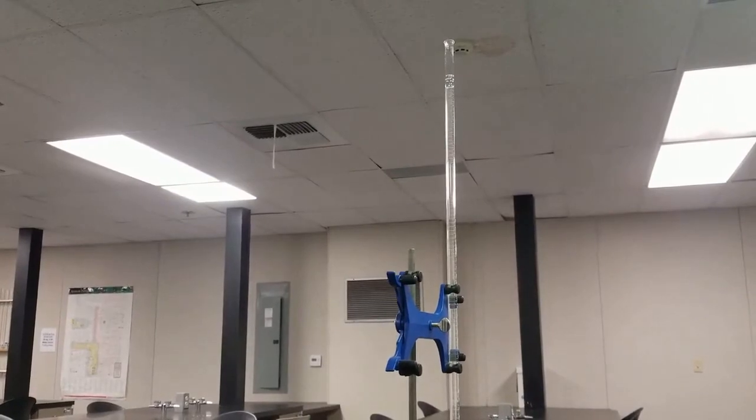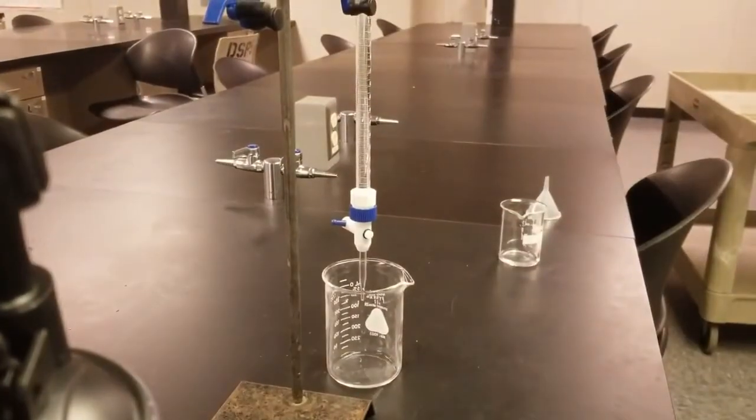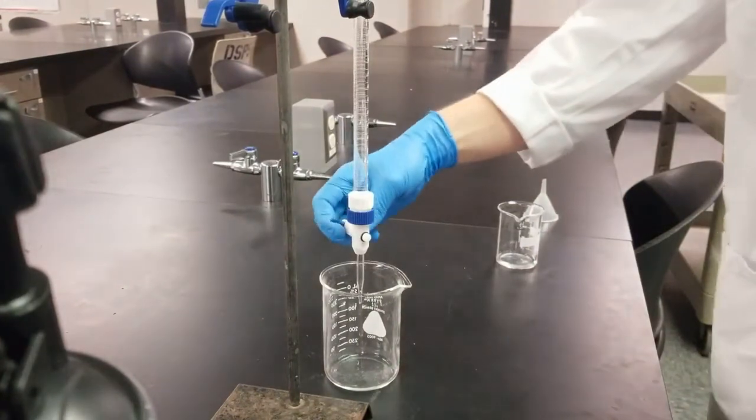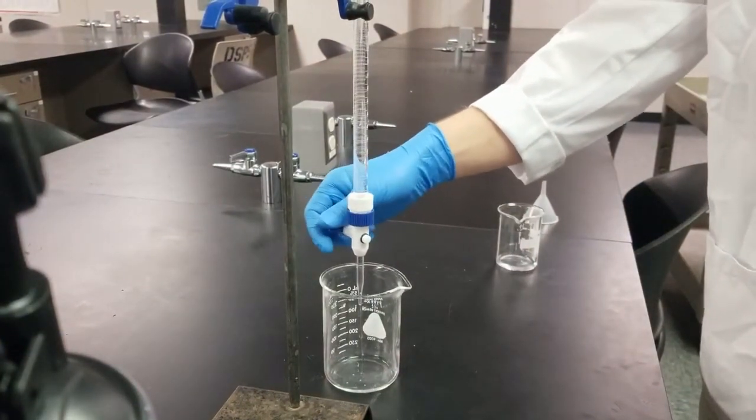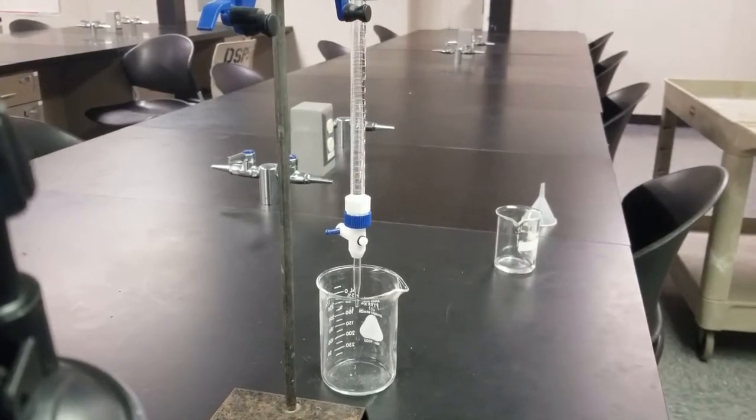Should be good. Now I'm just going to let a little bit out of the bottom just to make sure our apparatus is good to go. Looks like it's working well. And then I'm going to read the burette for my initial reading.